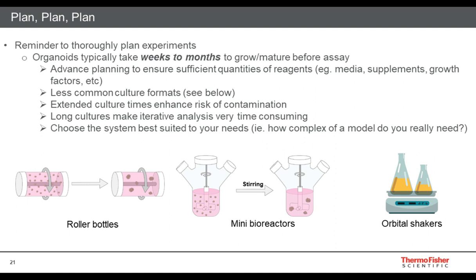So as I wind down here in the last couple of slides, one of the other things that are probably relevant or important for people who are looking to get started in 3D, or who have only recently started in 3D, is that these model systems tend to take very long to grow. Some of the cell line model systems are probably much shorter.